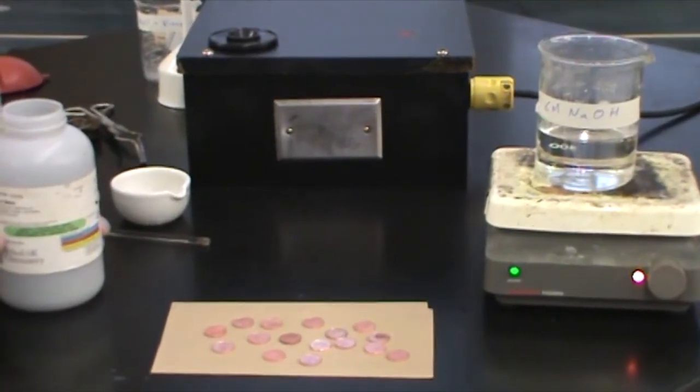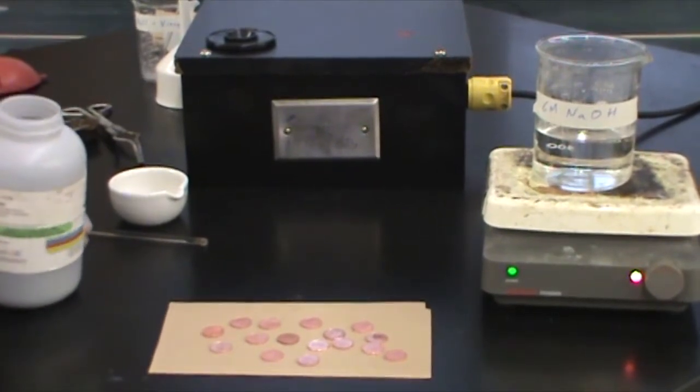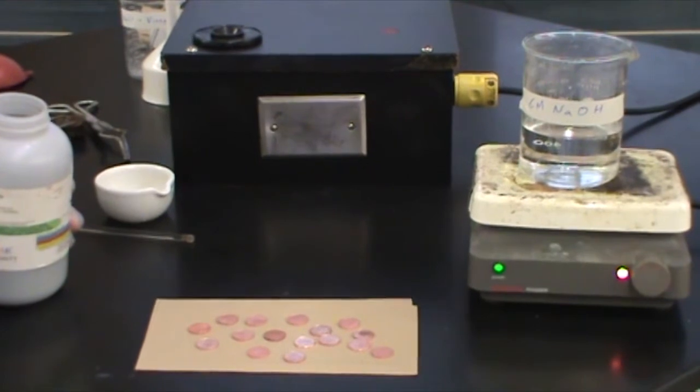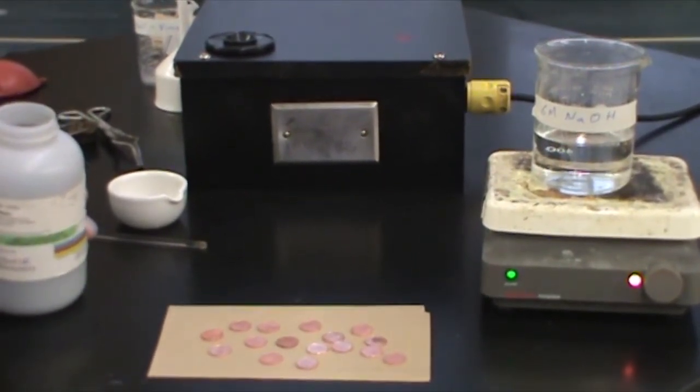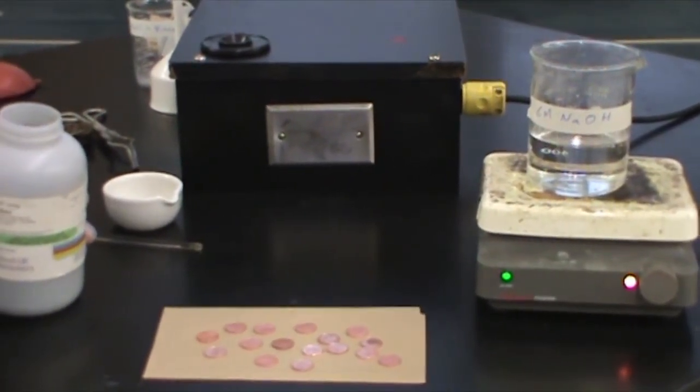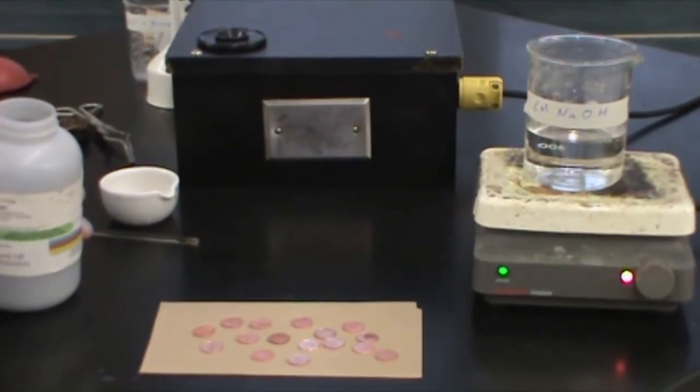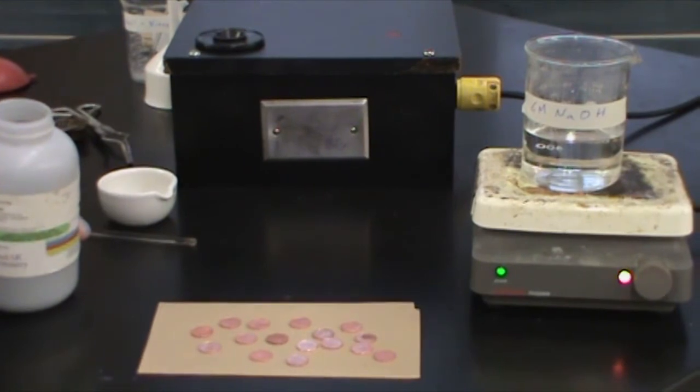While the pennies dry, I'll add some zinc powder to a six molar sodium hydroxide solution and heat the mixture. In this step, zinc dissolves in the hot concentrated sodium hydroxide solution to form sodium zincate. It is the zincate ion which allows zinc to plate on copper.